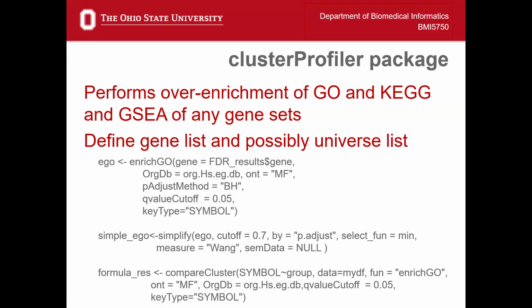So these are gene symbols. You might have Ensembl names. You might have Entrez names. You might need to convert from one type to another.